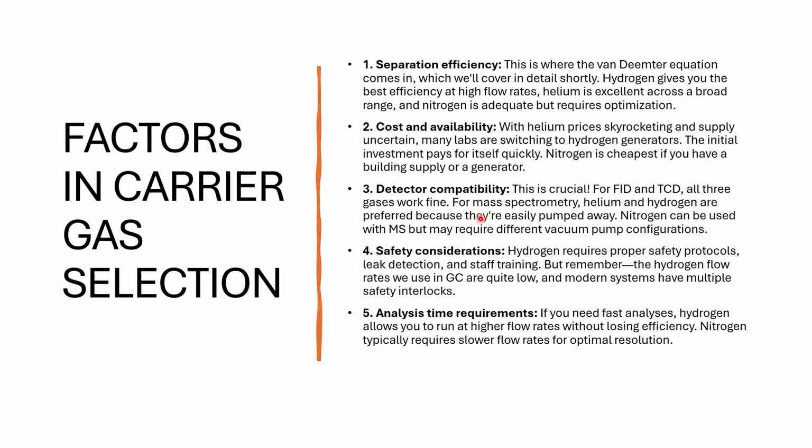Third one is detector compatibility. Now this is crucial. For FID and TCD, all three gases work fine. For mass spectrometry, helium and hydrogen are preferred because they are easily pumped away. Nitrogen can be used with MS but may require different vacuum pump configurations.